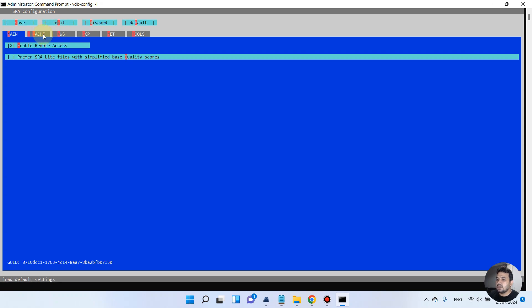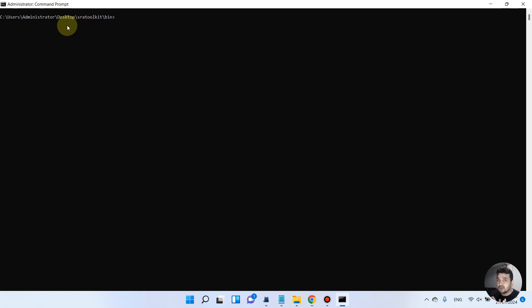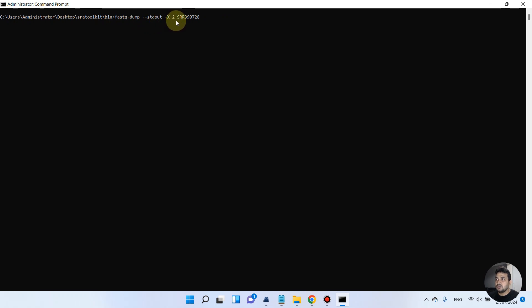If you need to change the download location, you can go to cache and change the directory. In our case we are not doing that, so we will just open the interactive terminal and quickly exit. We have now opened it, done nothing, and exited. I will paste these commands and the link to the NCBI GitHub page in the video description.